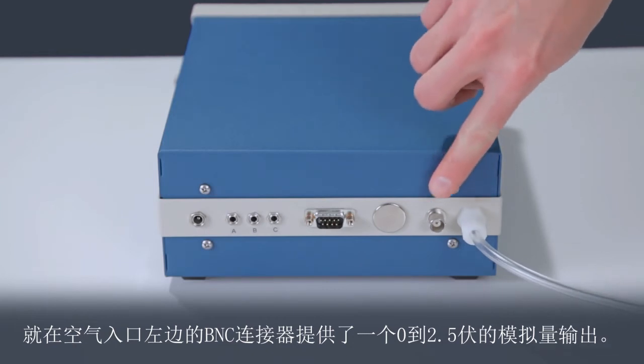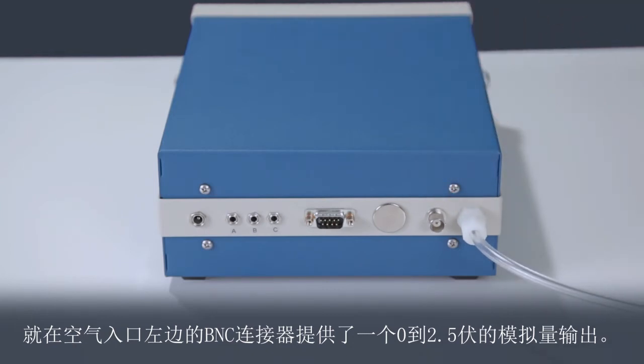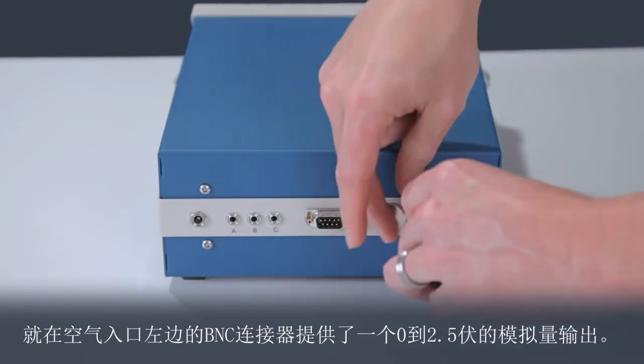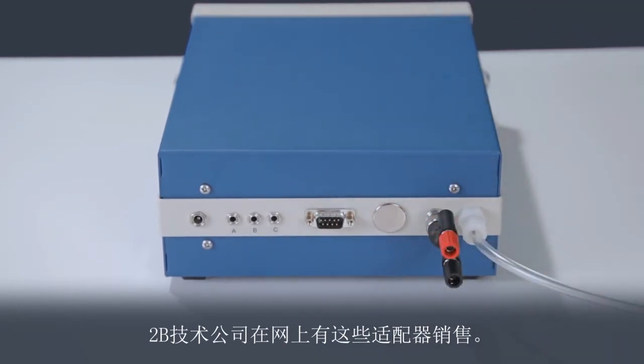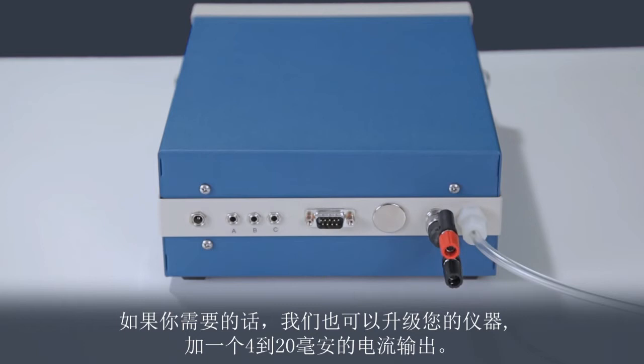The BNC connector just to the left of the air inlet provides a 0 to 2.5 volt analog output. 2B Technologies has these adapters available for sale online. We can also upgrade your instrument to include a 4 to 20 milliamp current output if you require it.